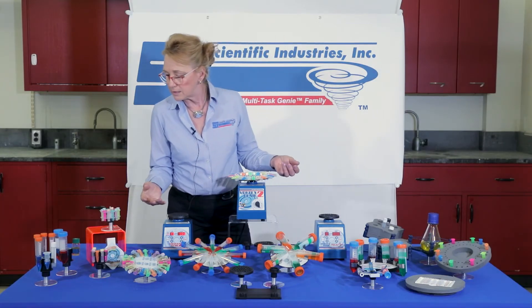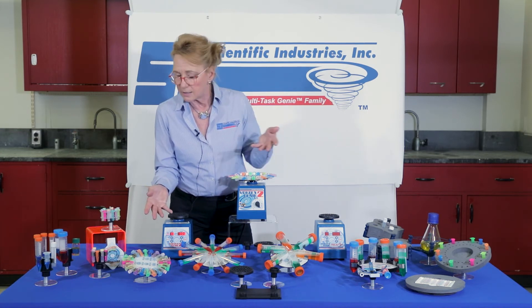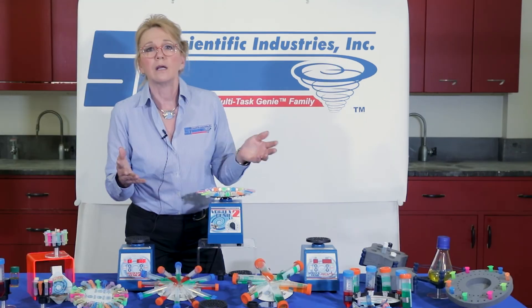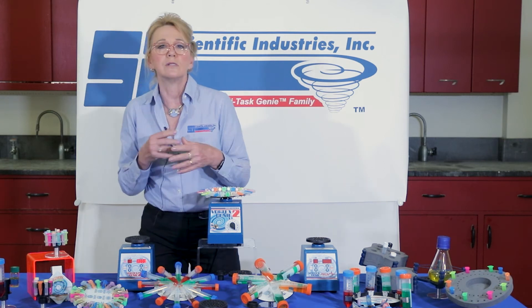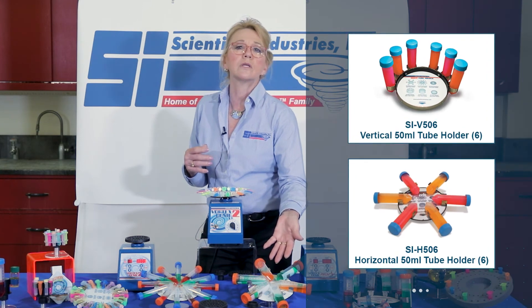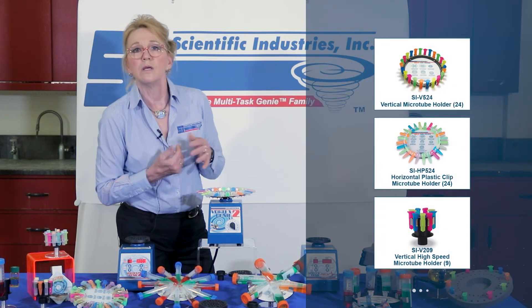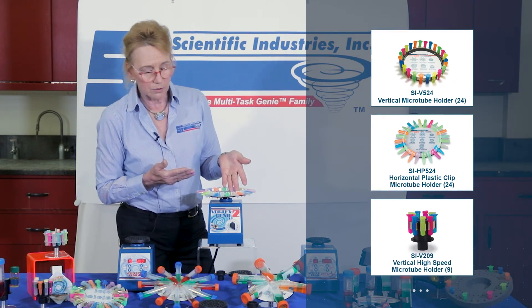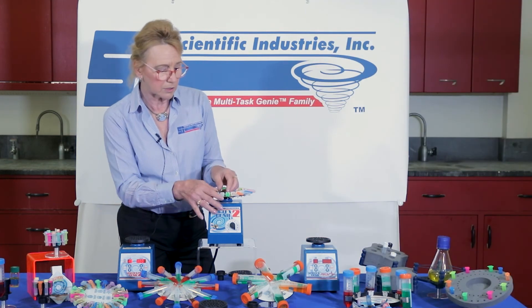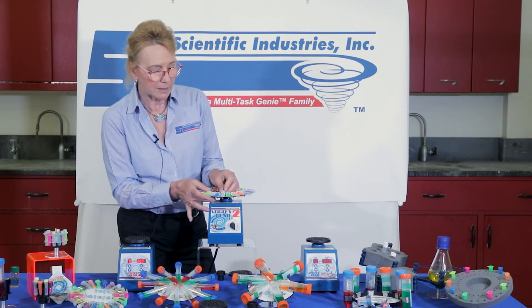What you can see on display here is a variety of accessories, and depending upon your specific application and tube requirement, we can accommodate many types of vessels in different sizes. We can do it in a vertical or horizontal position. We have several micro tube accessories, and when handling a micro tube, it doesn't matter whether it's a screw cap, snap cap, 1.5 or 2 ml — we can accommodate them all.